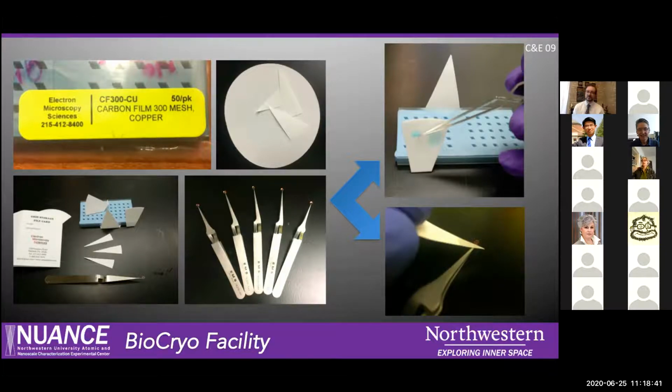Also, when you come onto that filter paper, you will not necessarily crush your grid, and if anybody's worked with these grids, they can be so fragile. The filter paper is soft enough that it's going to give, versus this other wicking technique that I believe Eric wants to put a few words in on.